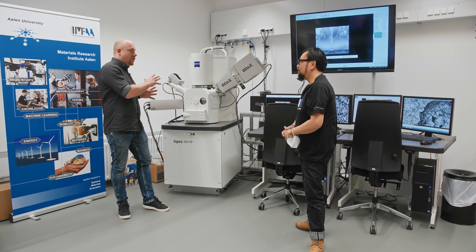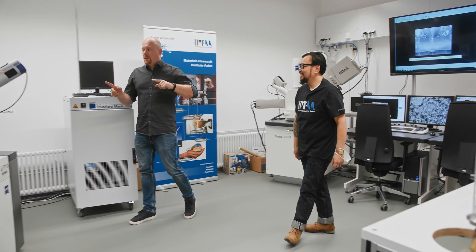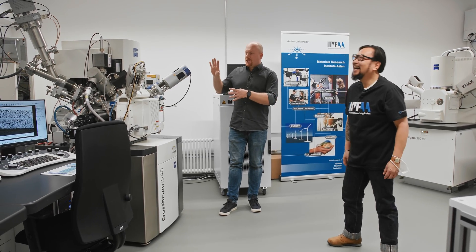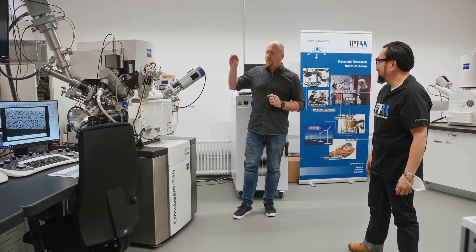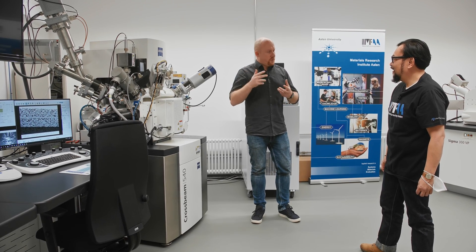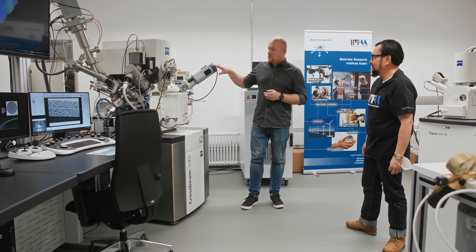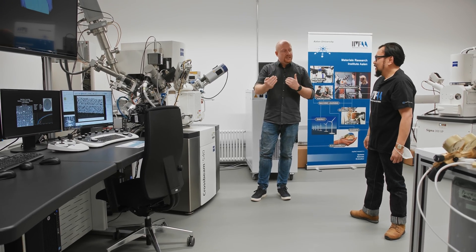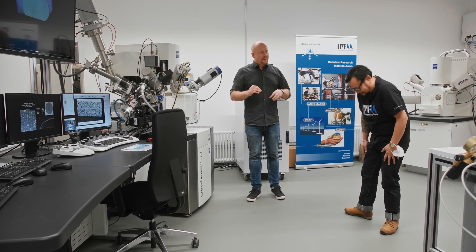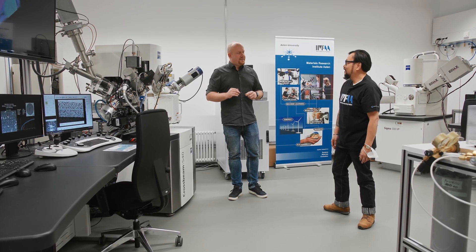If the Sigma is still not sufficient, we go over to my baby — the CrossBeam — where we have not just the electron beam but also the focused ion beam to very precisely prepare cross sections and do milling. We also have analytics here: two EDS detectors, EBSD for 3D EBSD — 3D microstructure characterization down to the nanometer scale. That's insane.